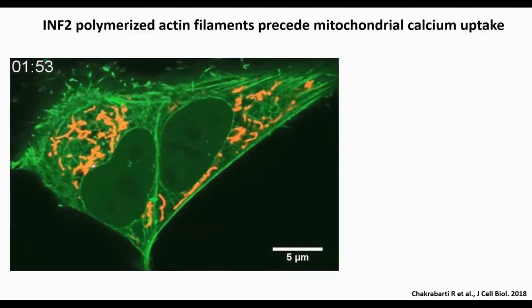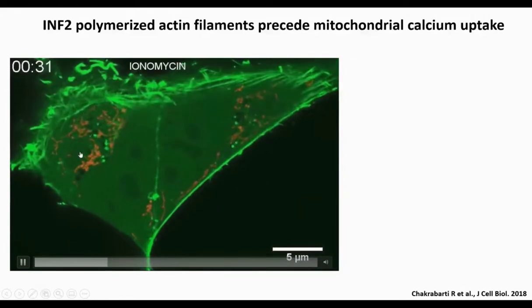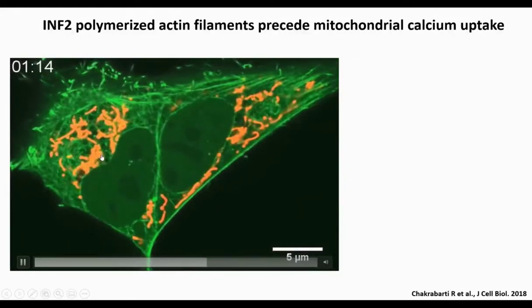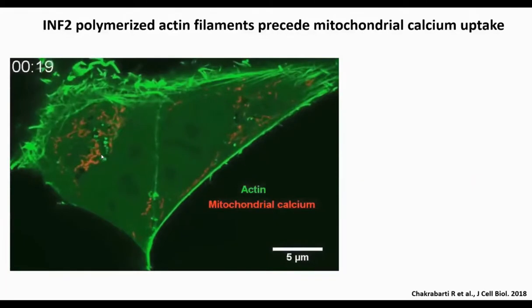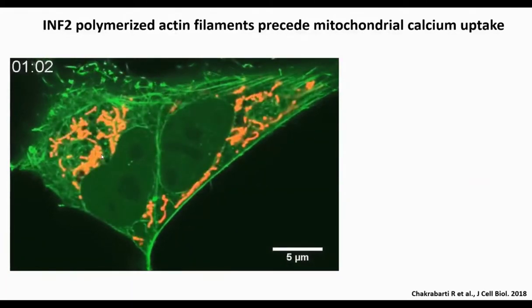So there was a definite time gap between the actin filament assembly, which happens right at this point, and then the mitochondrial calcium going up. So this was very intriguing to us. Now, we wanted to confirm this just because mitochondria is an excellent calcium buffer.